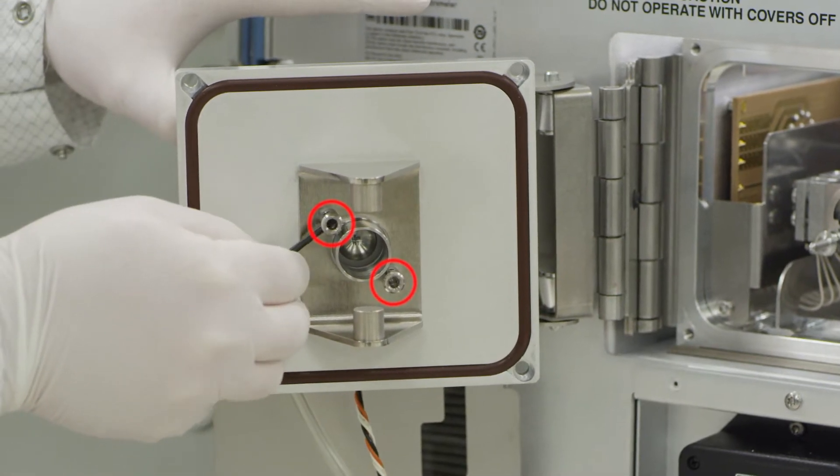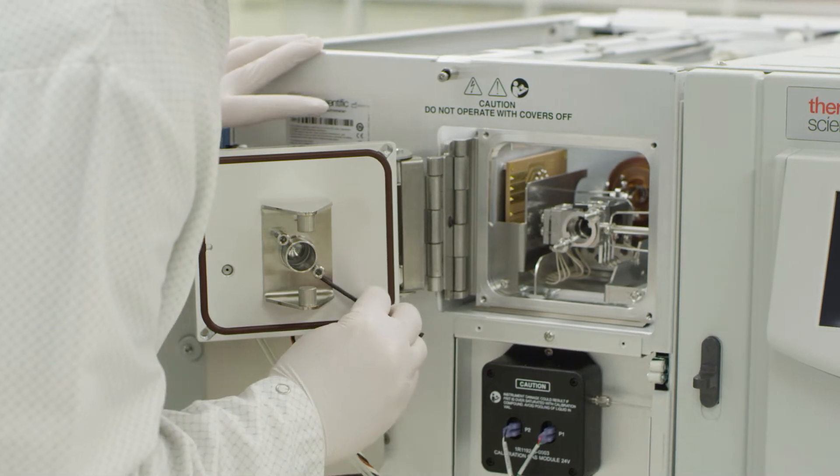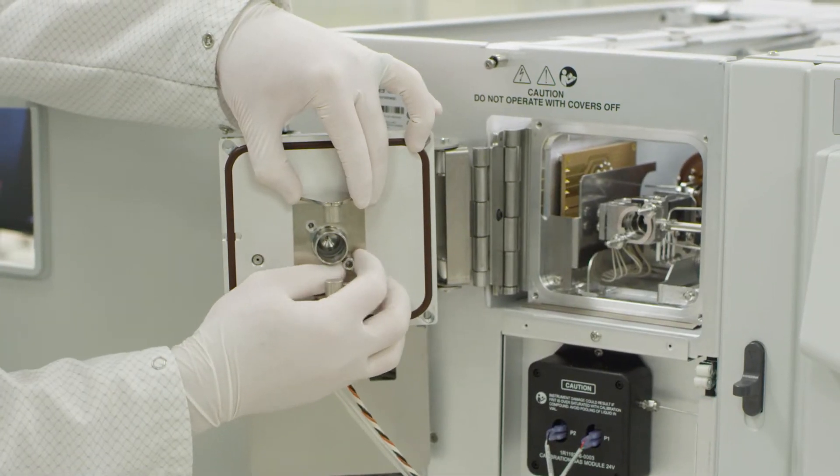Remove the yoke from the manifold door by unscrewing the sockets with an L-shaped tool. These sockets will be used to secure the AEI magnet assembly.